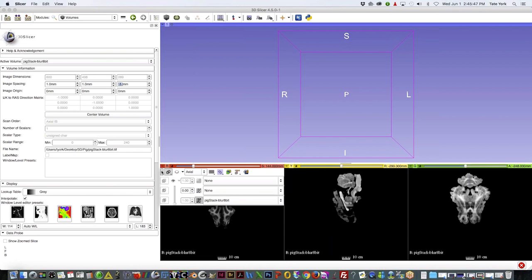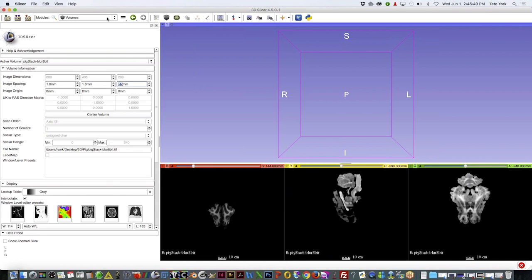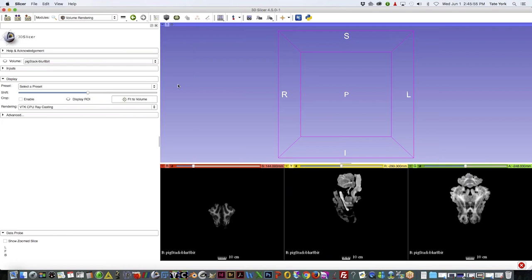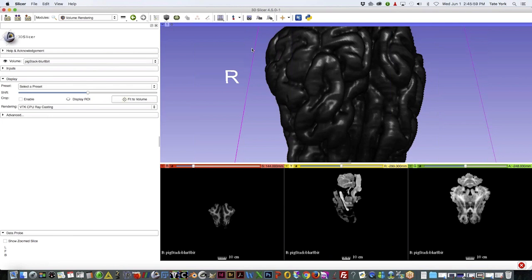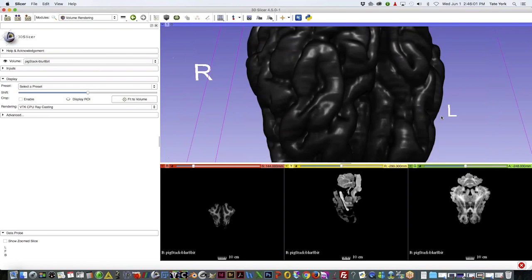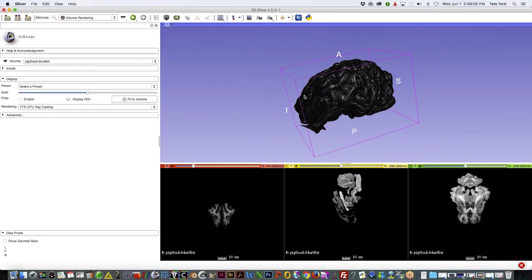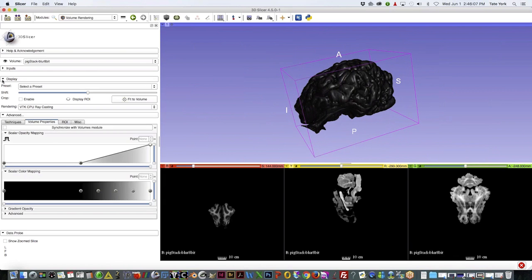So you have these ROIs, these little colored balls on the side of each face of the cube here. And what we can do is take these, drag them any which way you want, in a vertical or horizontal or coronal, sagittal, or horizontal plane.